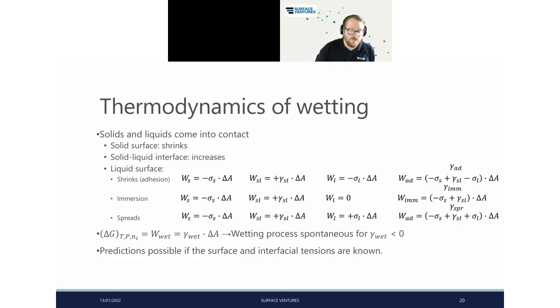In terms of the thermodynamics of wetting, a little bit more thereof. Solids and liquids, when they come into contact, you can think of this in terms of the increase in the solid to liquid interface, and you can have different things happening with the liquid surface. So you can have that shrinking, and these are the equations that define that in terms of the work for the solid, liquid, and adhesion. I'm not going to go through these in a lot of detail, but because the video will be available later, you'll be able to look at these.